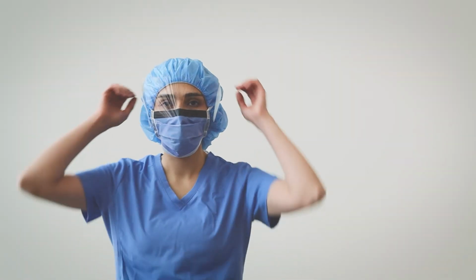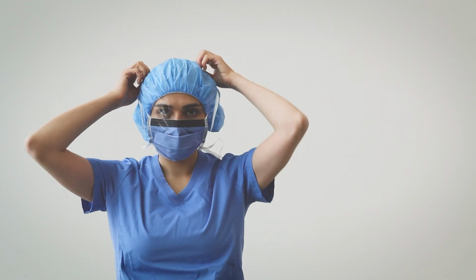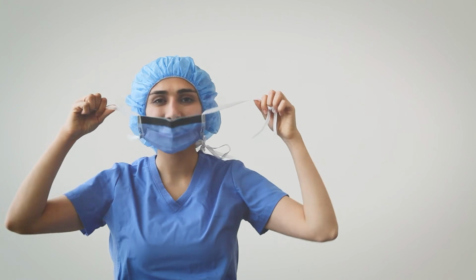When you are ready to remove your mask, make sure your hands are clean, and release the mask by breaking or untying the bottom ties followed by the top ties. Avoid touching other parts of the mask to prevent contamination, and discard appropriately.